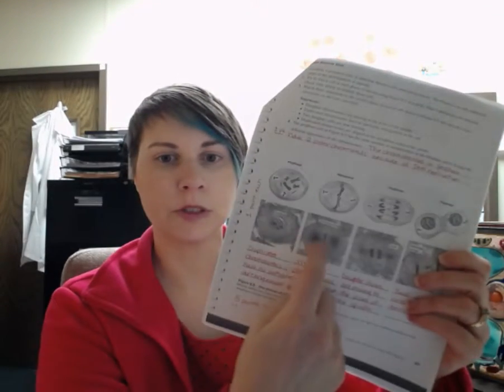Then definitely make sure that for the animal cell and the plant cell, like here's the animal cell, you can identify prophase, metaphase, anaphase, telophase. Also remember the animal cell is going to have the cleavage furrow, so I'll definitely have a station where you have to identify the cleavage furrow. And then plant cell, same thing. Make sure that you can identify a cell that's in prophase, metaphase, anaphase, telophase.